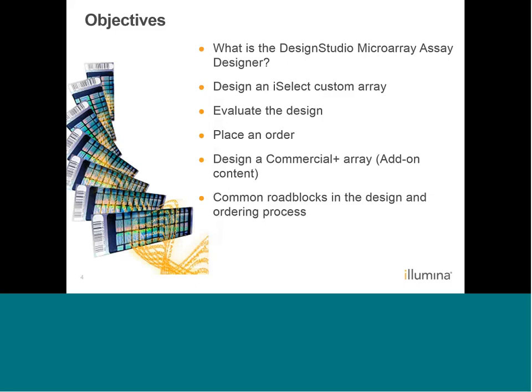Today, we're going to talk about just what is the DesignStudio Microarray Assay Designer. We'll design an iSelect custom array. We're going to evaluate that design, and that's an iterative process. Finally, we'll place the order. Then we'll look at how to design a commercial plus array, that is, add-on content to an existing Illumina array. And we'll look at some common roadblocks in the design and ordering process.